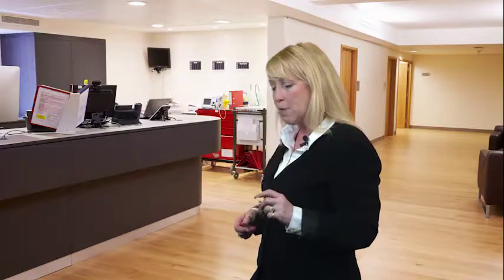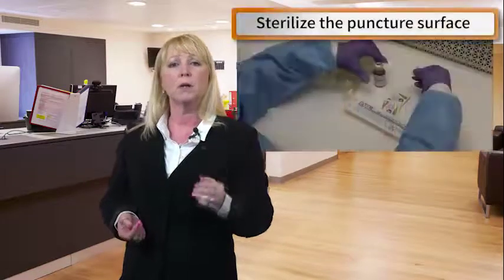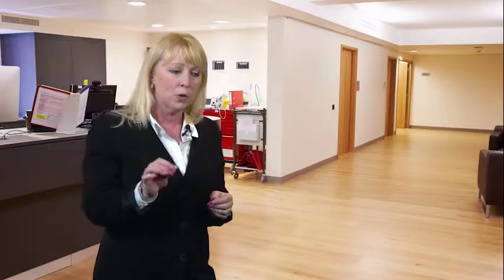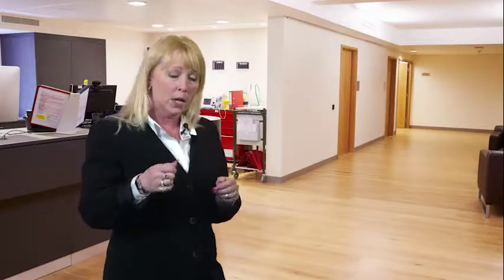Now, when you're using vials that have medications in them, and you might be using them for mixing different solutions, you want to make sure that you're sterilizing the puncture surface. This is going to be on the top of the vial. And the way that you're going to sterilize this surface is you're going to use an alcohol wipe. But you want to make sure that you use a new alcohol wipe for each surface. So if you have 2 to 3 vials, you're going to need 2 to 3 wipes. And you don't want to use the same one, because it could be that there's something on there that you're going to carry over to the next one, and in fact you'd be contaminating that.